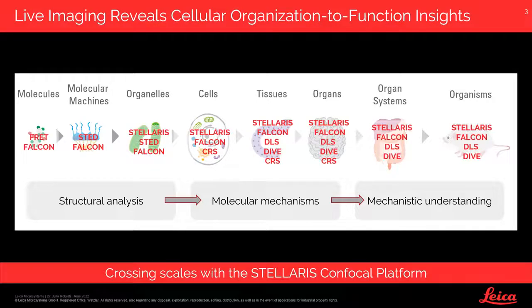And I hope to show you in this presentation how different tools and modalities integrated in our STELLARIS Confocal platform can help you in this quest across scales.